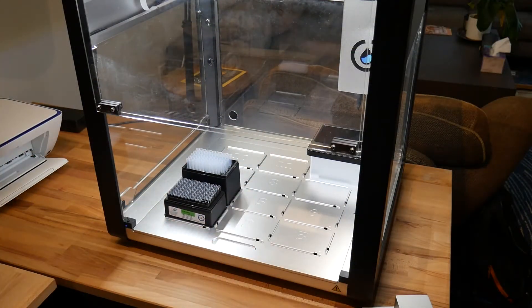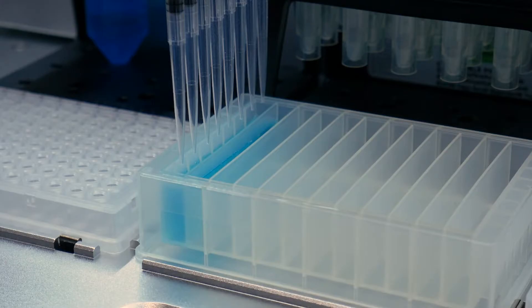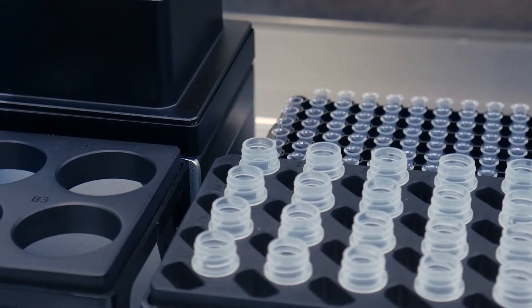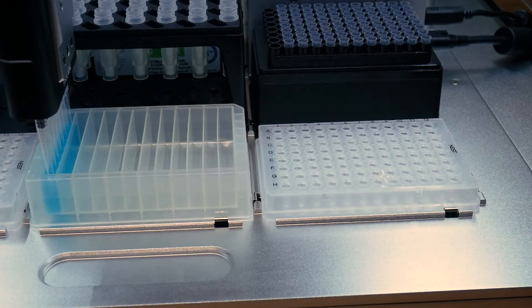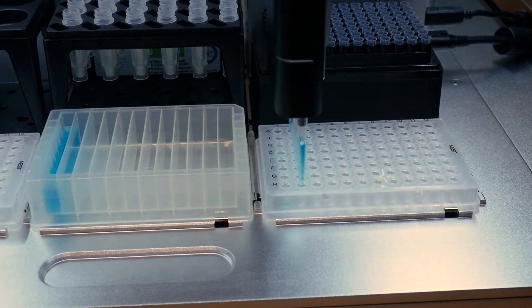Then when you've loaded everything onto the deck and you're ready to run your first protocol, you'll need to do an initial labware calibration to teach the OT-2 where each piece of labware sits on the deck. This takes another 5 to 10 minutes depending on the complexity of your protocol. It's that easy. Once the robot is calibrated for a protocol there's no need to recalibrate before every run — just click start and the robot takes care of the rest.